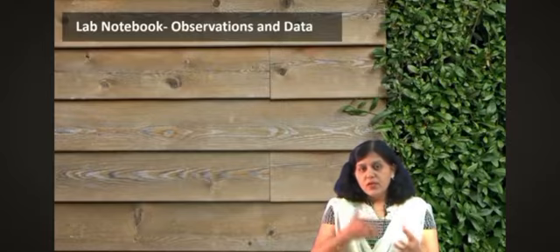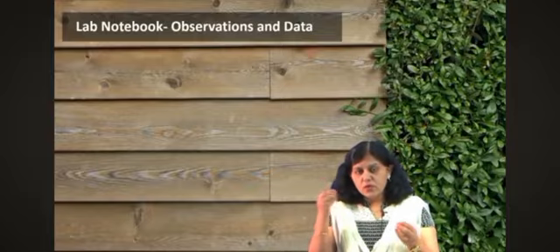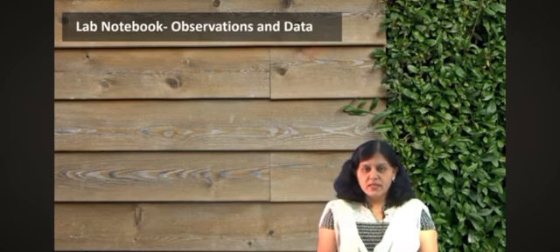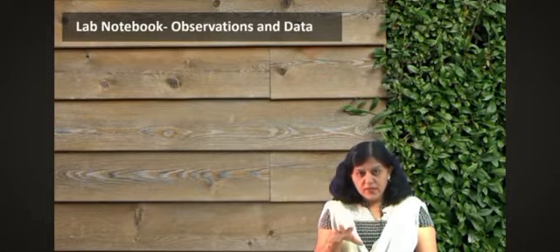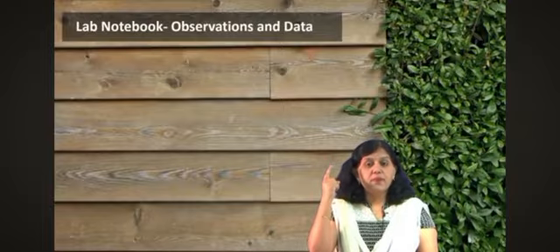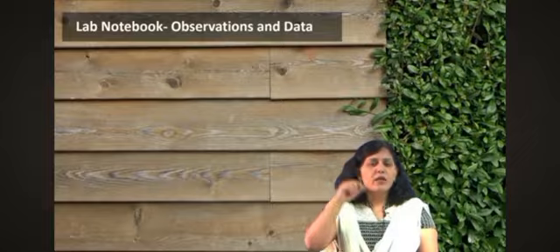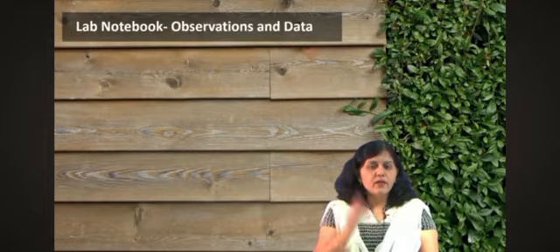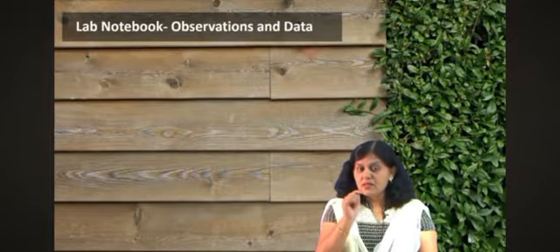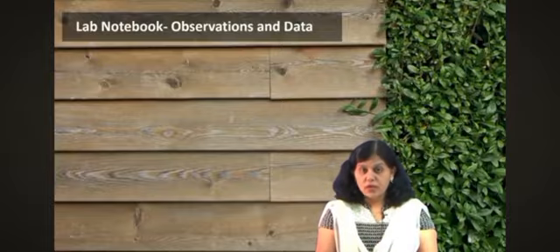And then obviously, however you want to conclude, that conclusion part you should also write precisely. If you do this very cautiously, then when you are writing a research paper, or when you start thinking that after 2 years you can file an IP on this, that a very good result came and now you are thinking of filing IP, then at that time this discussion and conclusion part will help you to communicate with an attorney.